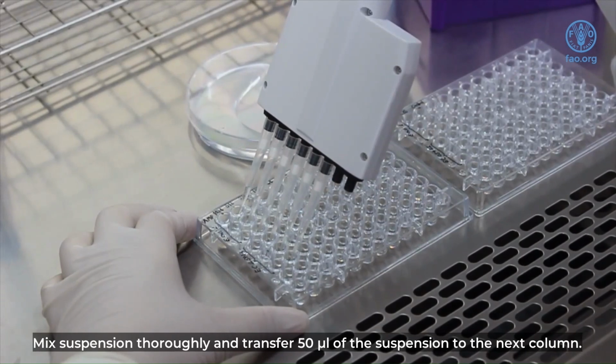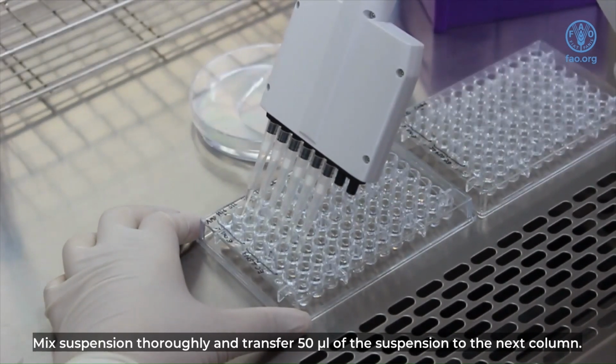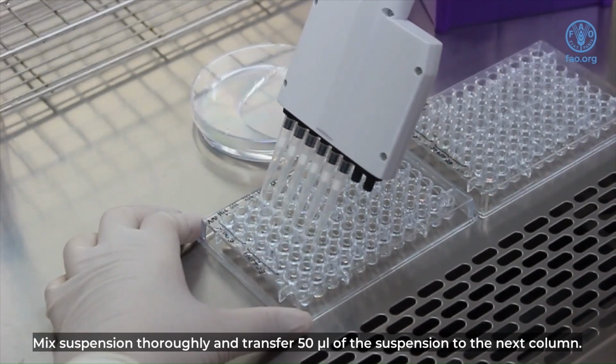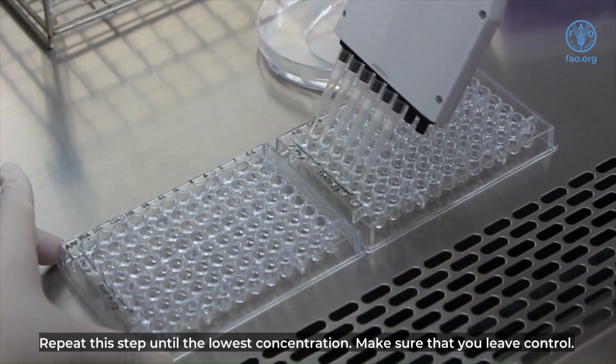Mix suspension thoroughly and transfer 50 microliters of the suspension to the next column. Repeat this step until the lowest concentration. Make sure that you leave control.